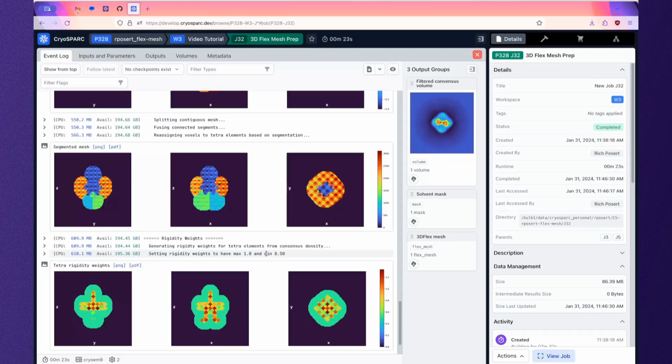We covered the strategy behind what you might want to segment out from each other and what you might want to combine into one segment, with the idea being that anything you expect to have a different rigidity, or to slide past each other or move away or toward each other, you might want in separate segments.